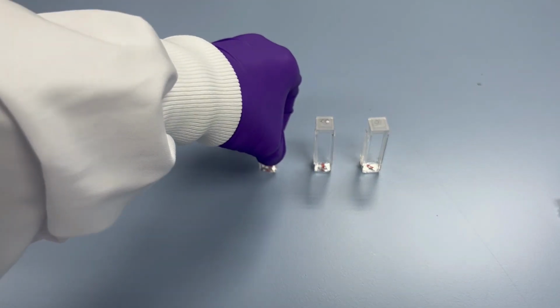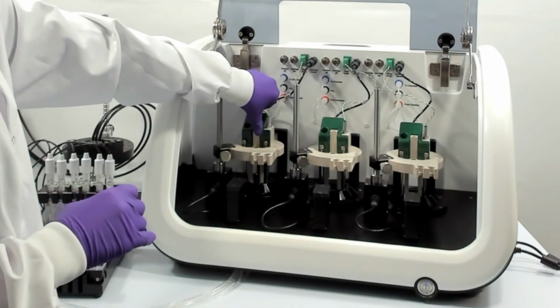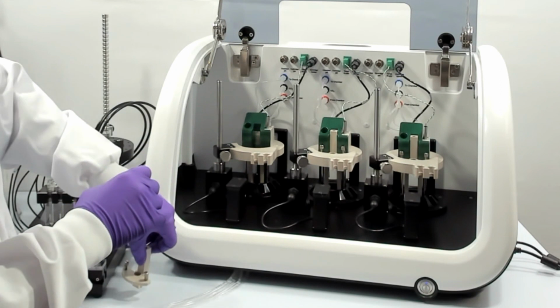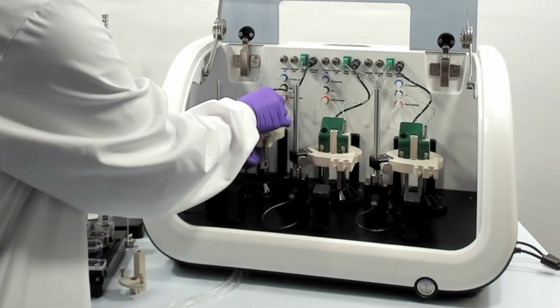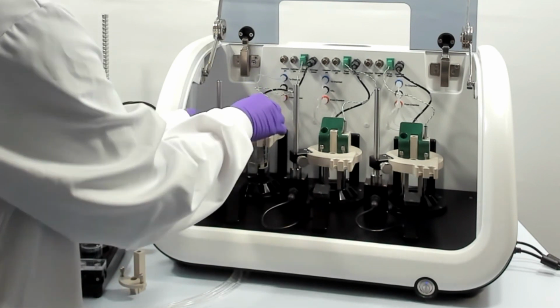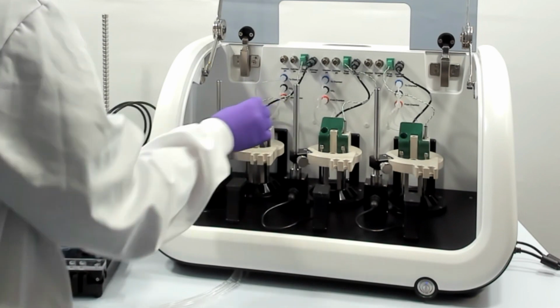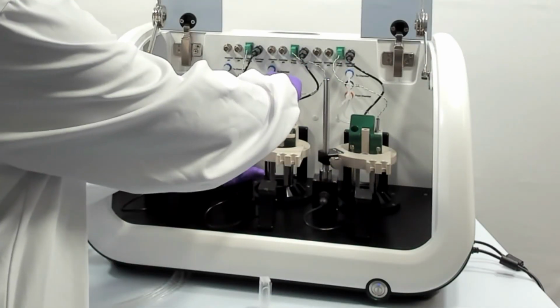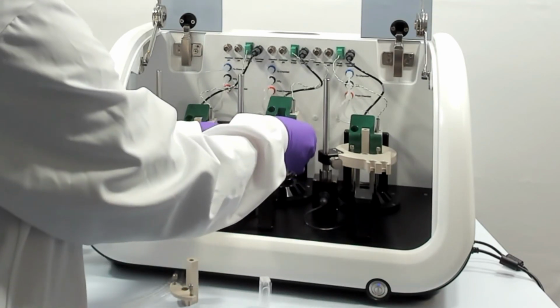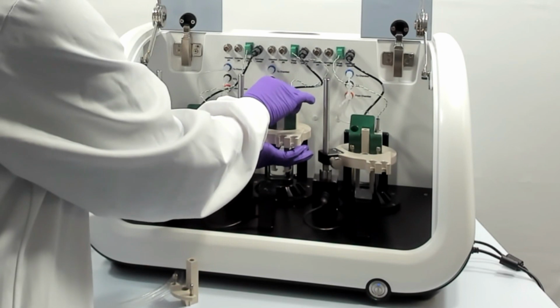We then take the cartridge over to the system, remove the probe holder from the cartridge holder, and place the cartridge inside. We can then do this for all of the other cartridges, lifting the lids, sliding the cartridges in place, and putting the probe holder back on top.